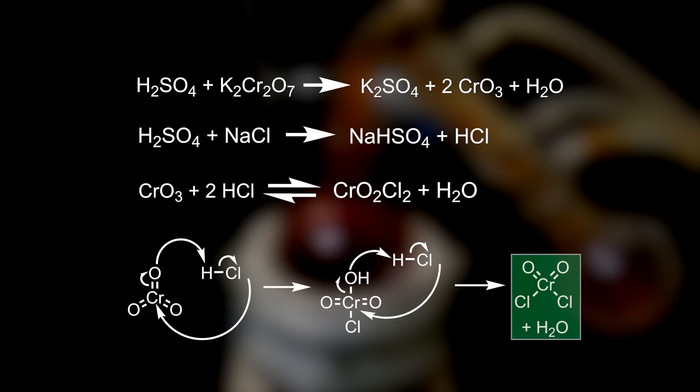The reverse reaction can also take place, where chromochloride reacts with water, but it is mostly sequestered by the concentrated sulfuric acid, which prevents the water from reacting, as well as distilling over.